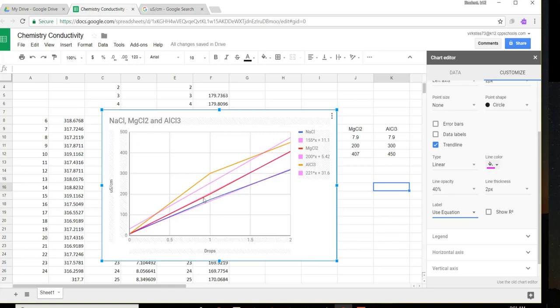At this point, you can copy this, put it into a Google Doc, and then from the worksheet we did for the activity for the lab, this takes us all the way to, on the very last page, the data table. You can create a data table, you have the slopes, and then you can go ahead and answer the 4 questions in processing the data. So with that should be pretty good with this.